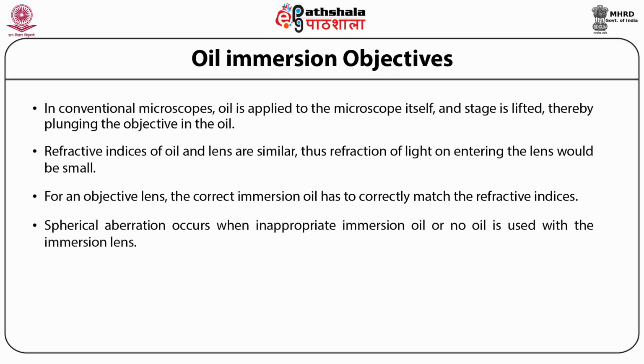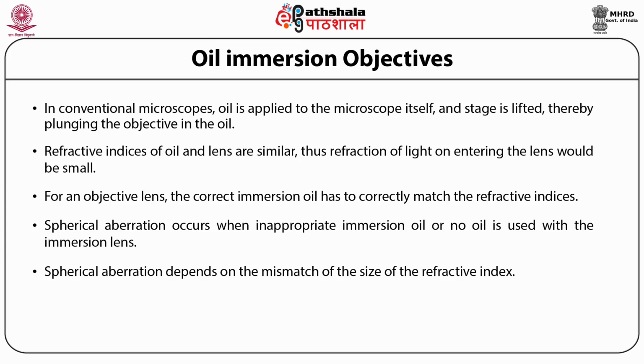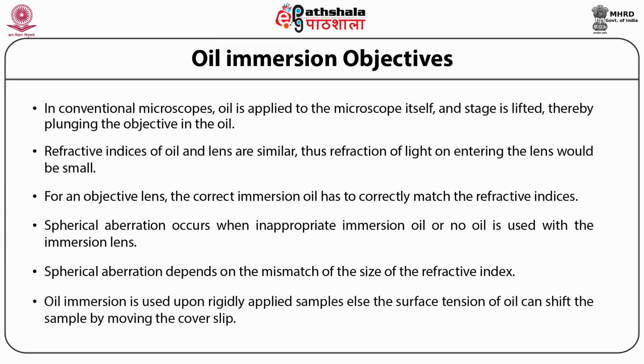Also, spherical aberration occurs when inappropriate immersion oil or no oil is used with the immersion lens. Then the spherical aberration depends on the size of the refractive index mismatch. Oil immersion is used upon rigidly applied samples, else the surface tension of the oil can shift the sample by moving the cover slip. This can also occur in inverted microscopes as the cover slip is under the slide.